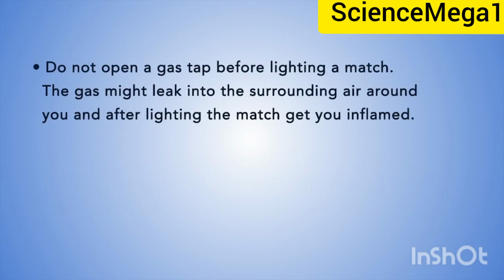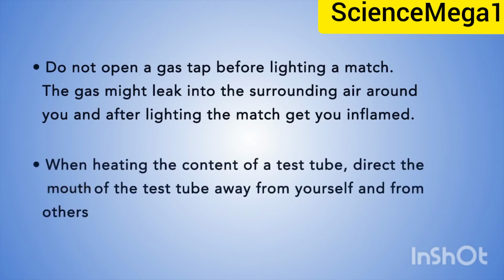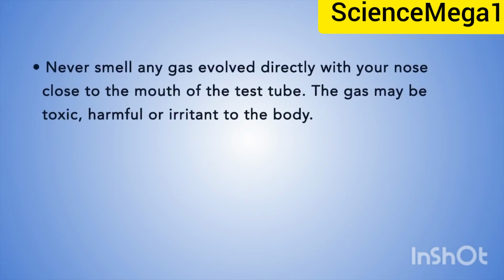3. Do not open a gas tap before lighting a match. The gas might leak into the surrounding air around you and, after lighting the match, set you on fire. 4. When heating the content of a test tube, direct the mouth of the test tube away from yourself and from others. 5. Never smell any gas evolved directly with your nose close to the mouth of the test tube. The gas may be toxic, harmful, or irritant to the body.